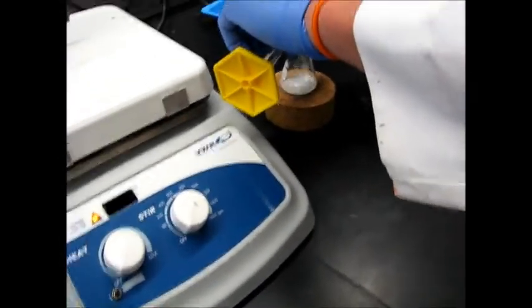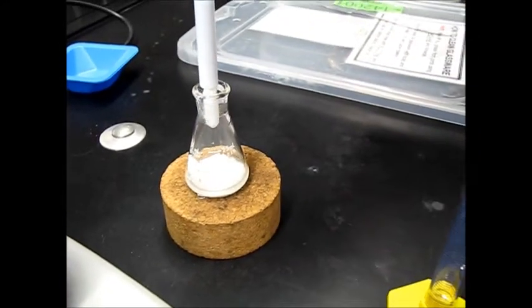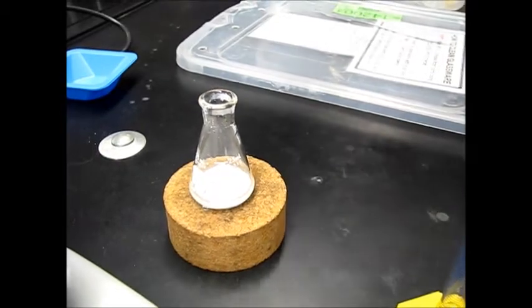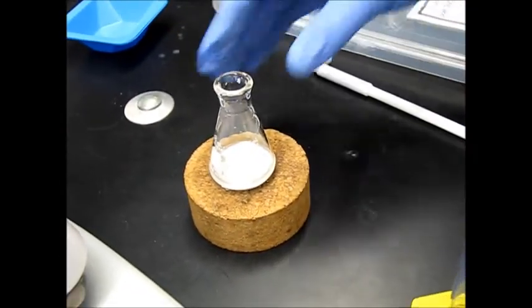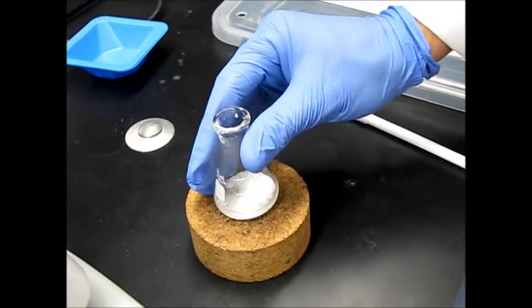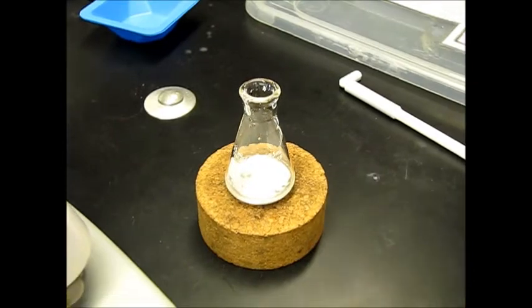Just to make sure we don't lose any product. And you see we get precipitation right there. So all that white stuff is our 9-hydroxyfluorene. It's soluble in ethanol, but it's not soluble in water. So whenever we add water, we make some of it precipitate out.